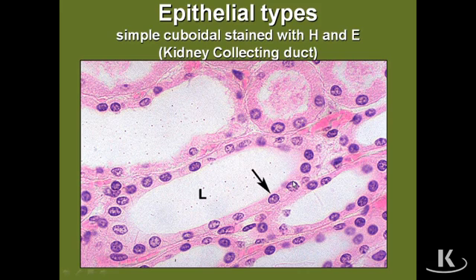First one is basically an epithelium that's known as simple cuboidal, highly characteristic of much of the tubules that make up the kidney. This happens to be a view of a collecting duct with a classic cuboidal epithelium and fairly well recognized cell boundaries that constitute the lining epithelium.